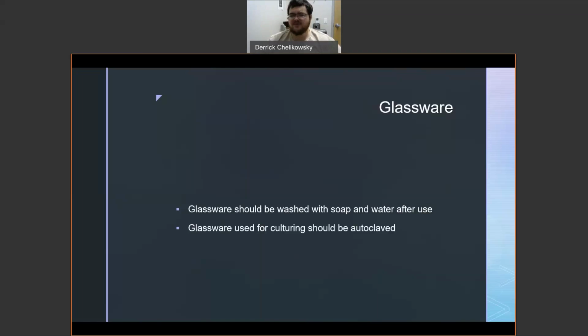Some plastics, most notably Nalgene, are autoclave safe, but most of them are not. Glass is autoclave safe, as is most high-grade lab coats. If you have a lab coat that is a lower grade or is a disposable lab coat, it will not survive an autoclave. If this is the case, speak with your TA or me, and we'll see about getting you a lab coat that can be used multiple times and autoclave multiple times if necessary.